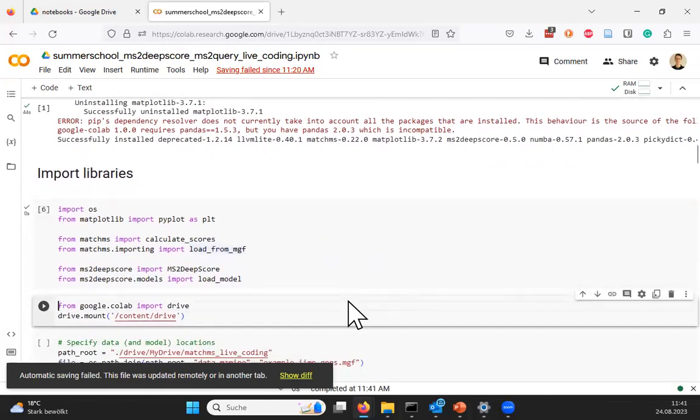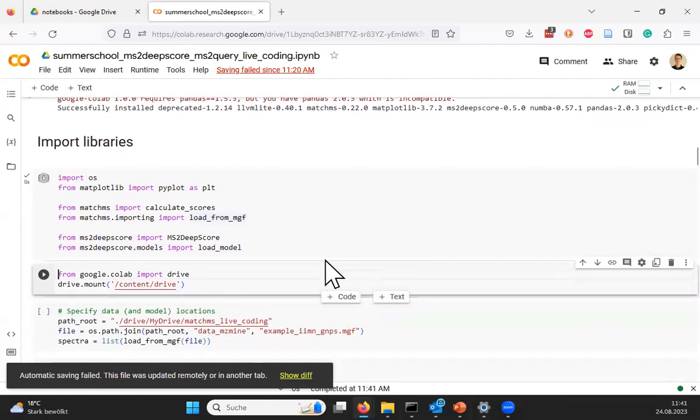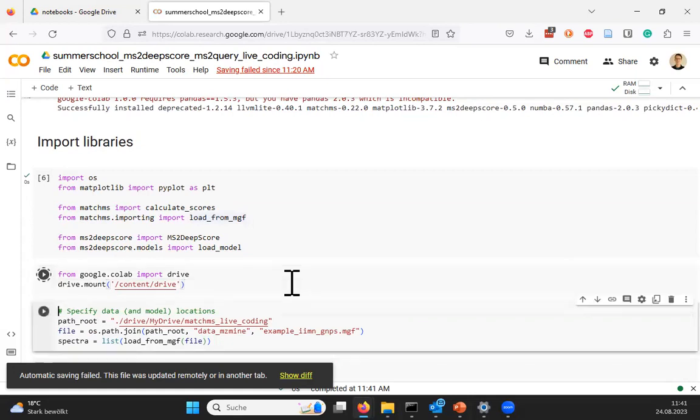And we will go quickly through these code cells because they are exactly what we did before in the other methods. They should be exactly the same. So the first steps are completely identical, so we can go very quickly through them. The only change is that we also imported pieces from MS2DeepScore. The other code cells you can ignore for now, you can only afford to ignore them if they work, but then you can ignore them.